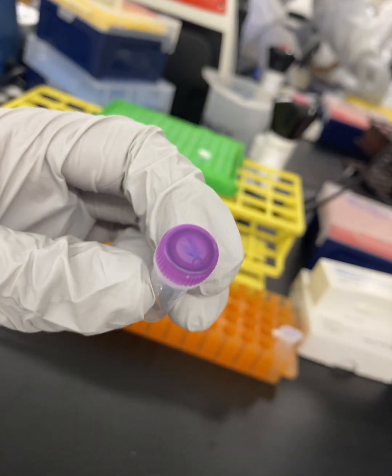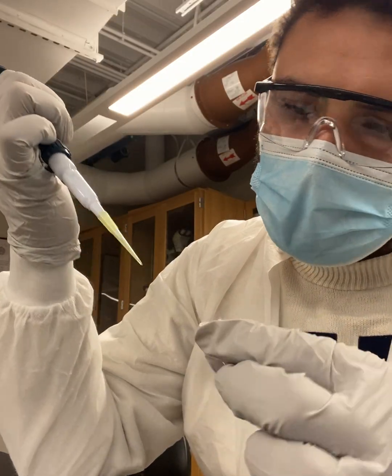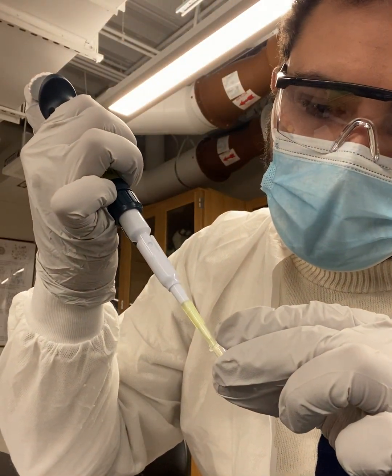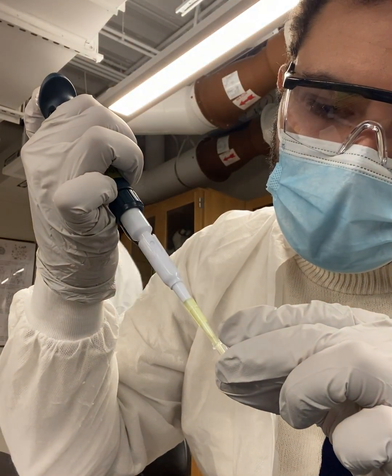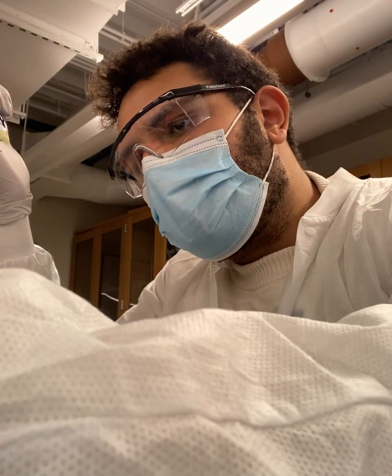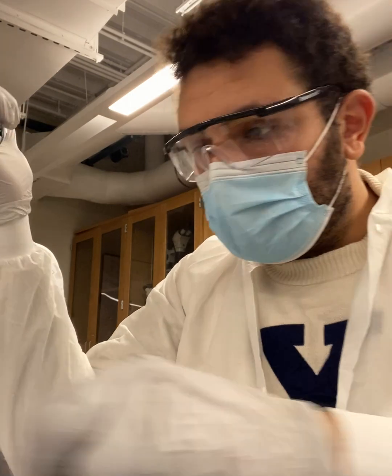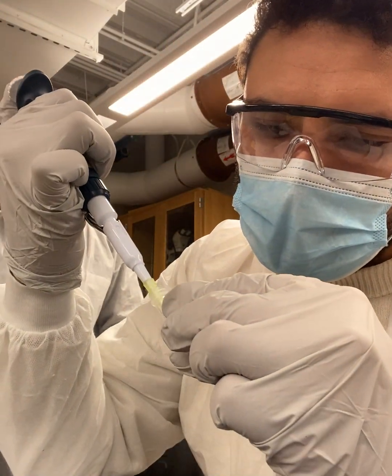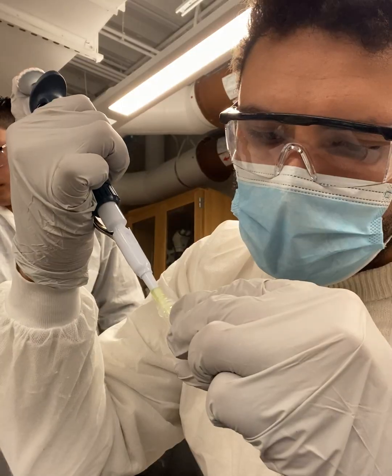We start by setting up the TOPO TA cloning reaction. Into a sterile PCR tube, we combine 2 microliters of the PCR amplified mutant gene, 1 microliter of the provided salt solution, 1 microliter of the PCR4 TOPO vector, and 2 microliters of nuclease-free water. We mix the reaction gently and incubate the tube for 5 minutes at room temperature, then immediately place it on ice to preserve the ligated plasmid.